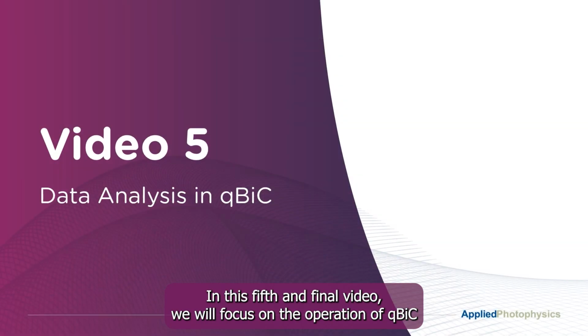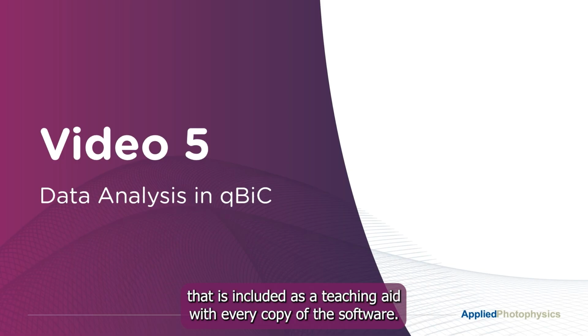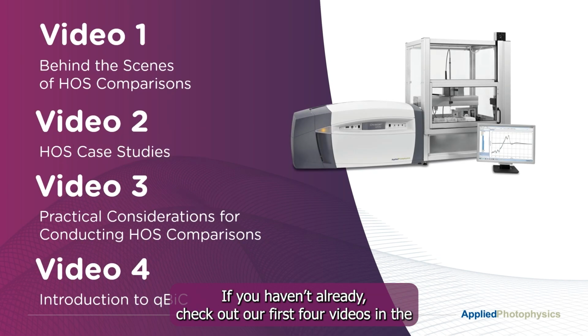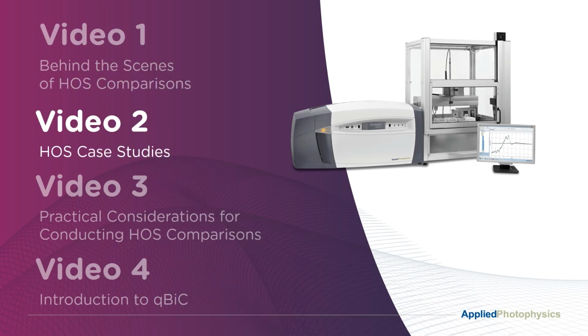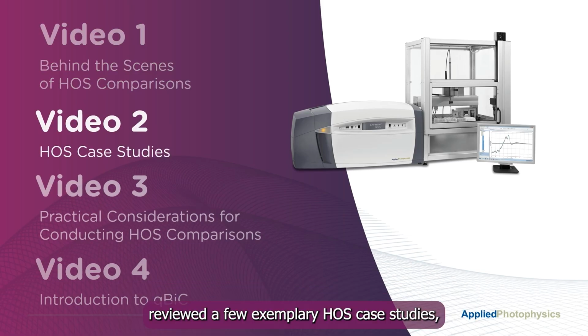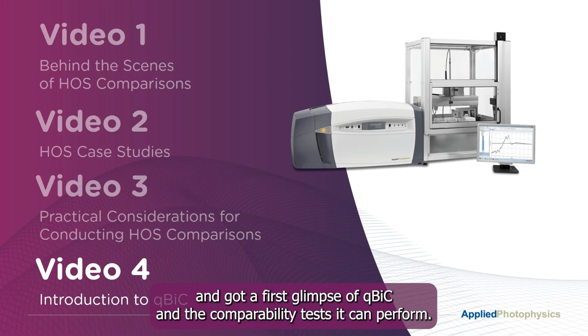In this fifth and final video, we will focus on the operation of qBiC, Applied Photophysics Higher Order Structure Comparison software, via stepwise analysis of an example dataset that is included as a teaching aid with every copy of the software. If you haven't already, check out our first 4 videos in the HOS series, in which we took a behind-the-scenes look at the math underpinning HOS comparisons, reviewed a few exemplary HOS case studies, discussed practical considerations for performing HOS comparisons, and got a first glimpse of qBiC and the comparability tests it can perform.